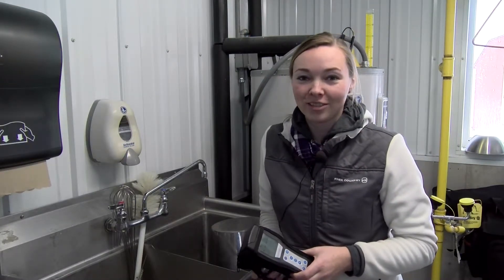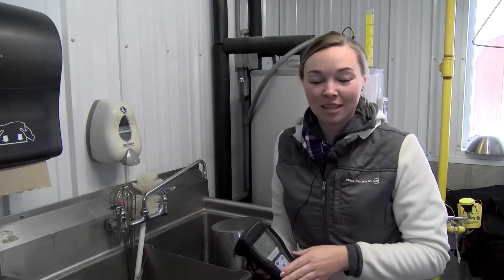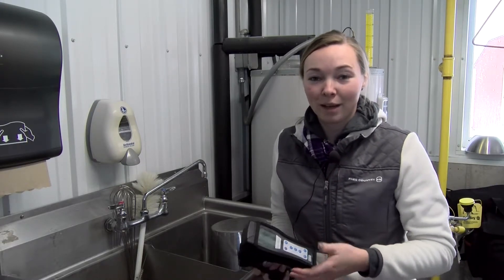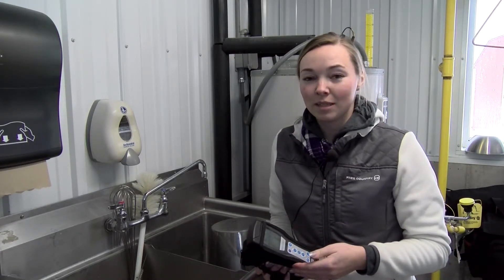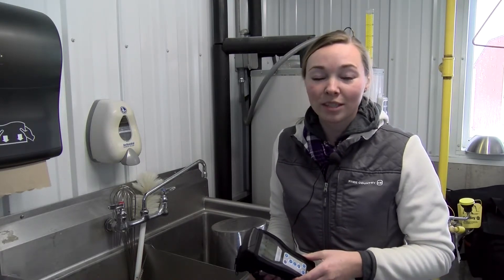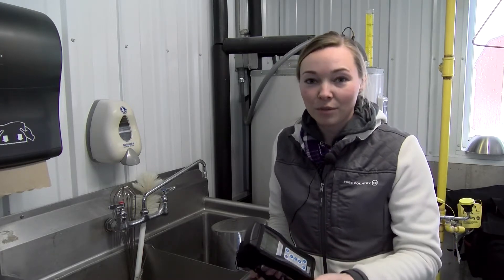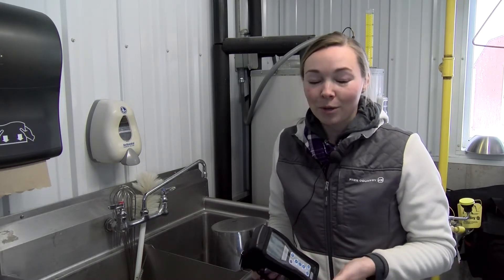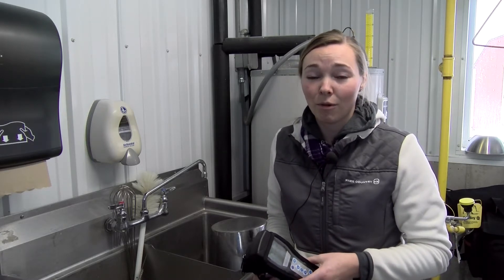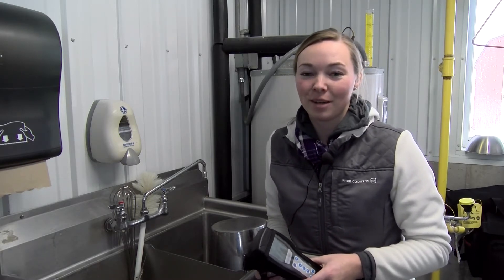Hi, I'm Mary Fronick from North Central Technical College Agricultural Center of Excellence. We at the NTC Farm have been using the ATP meter for a while now. It has helped us troubleshoot problem areas with our wet calves. By using the ATP meter, we have been able to determine high bacteria areas and problem areas on the farm, including feeding equipment, the auto feeder, and milk dispenser for the calves. By regularly monitoring those levels, we have been able to increase the average daily gain for our calves, their overall health, and ultimately have healthier calves and healthier cows.